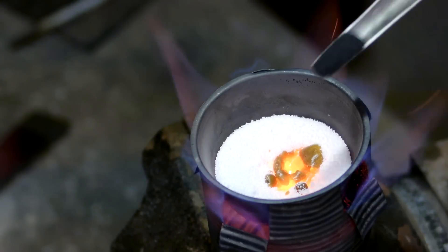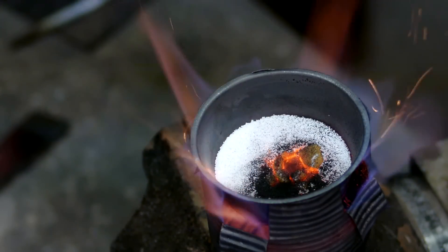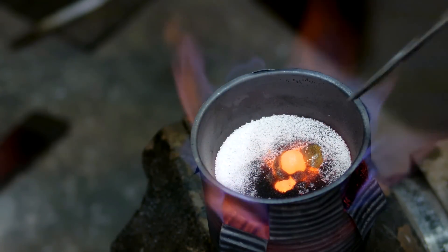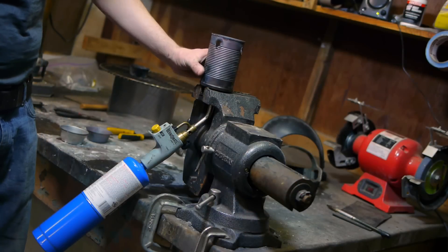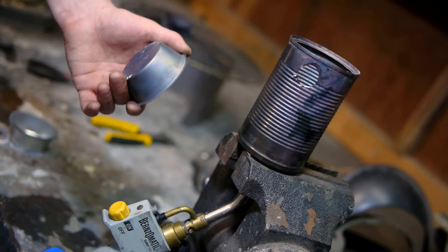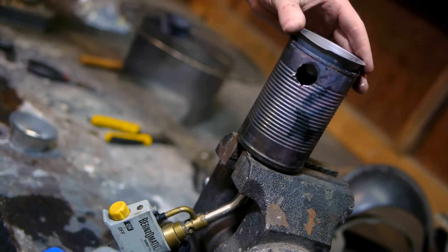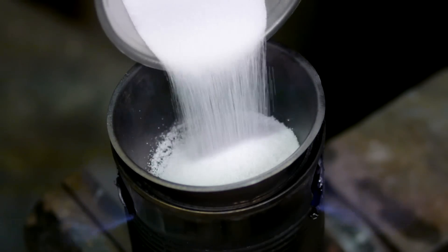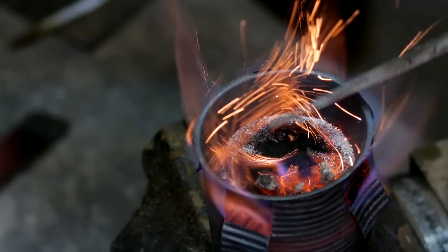The most interesting method I've found so far for creating alkali metals is the reduction of the metal's carbonate with carbon. My first attempts to conduct this reaction utilized my spiral flame torch contained in a soup can with a steel crucible above. I filled this crucible with some potassium carbonate along with an excess amount of charcoal powder.